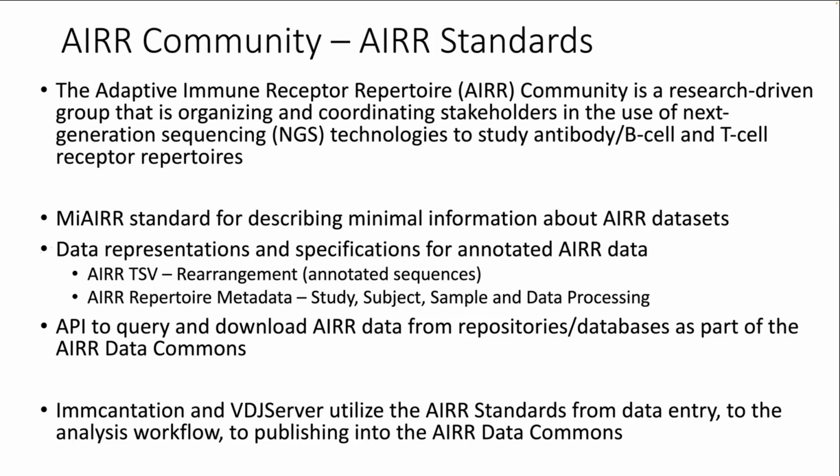One of the working groups, the Common Repository, was very interested in how we can share these AIRR-seq data sets, not just the raw data, but the processed, analyzed data, so that it could be queried and downloaded, so people can do additional analysis. That's really the basis of the AIRR Data Commons, and we defined an API for it. And at VDJServer, we want a really large repository of it, but there are other ones as well.